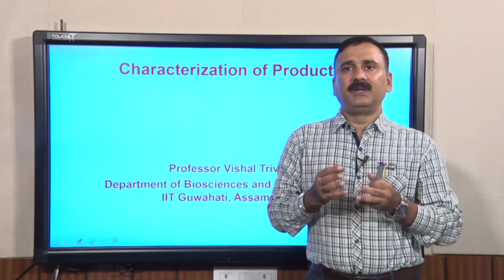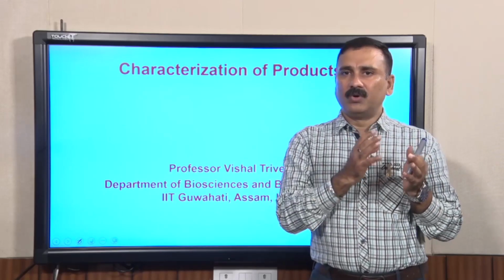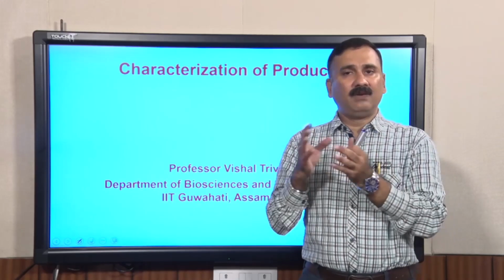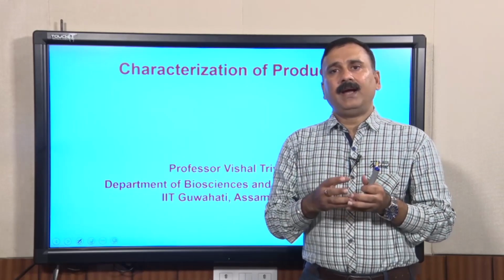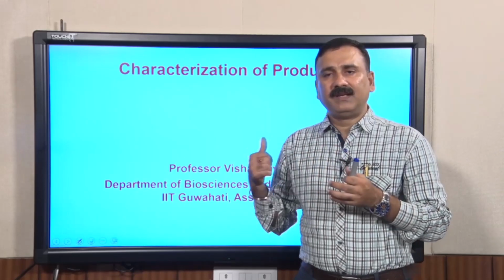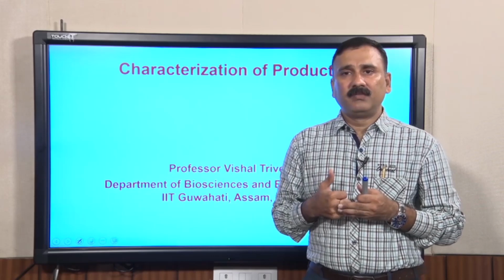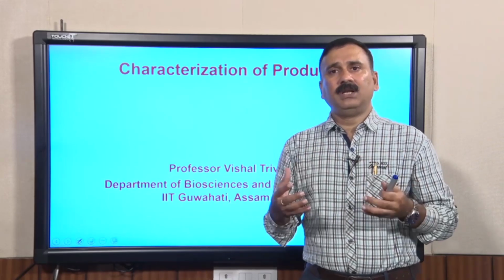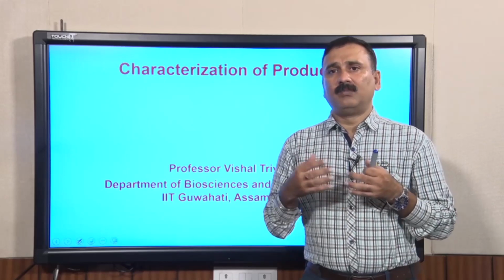So, for this purpose, so far we have discussed protein sequencing, to know that the protein you are getting from the host is the right protein. In addition, in the previous lecture we discussed how UV visible spectroscopy, or in general the spectroscopic techniques, can be used to characterize the product.